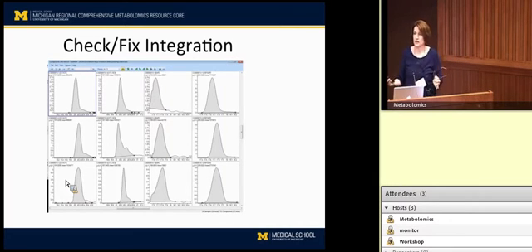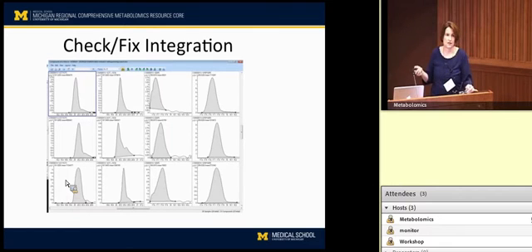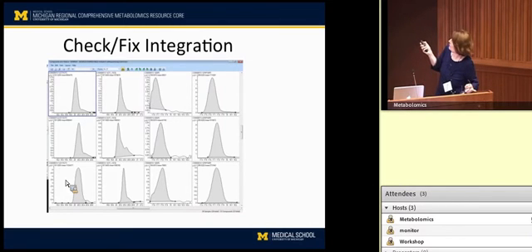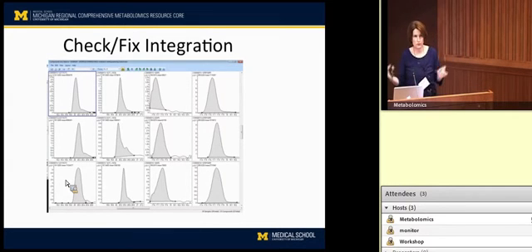We can't, like I said, there's no way for a person to go in and say, yeah, I'm definitely going to draw this line here and say this part's citrate, this part's isocitrate. It's just not possible to do consistently enough to give you good quantitative data, to be quite frank. So the analyst does need to go in and check all the integration here. In a situation like this, probably we need to go back and adjust the retention time a little bit so that the whole peak is within the retention time window that we're looking at, and make sure that it's integrating properly. Maybe look at bringing the background down a little bit because it's on a little bit of a slope here. So I just wanted to let you know a little bit about what goes into peak picking and what the analyst has to do. And sometimes it's a little bit time consuming, so that's part of the reason why I mentioned it too.